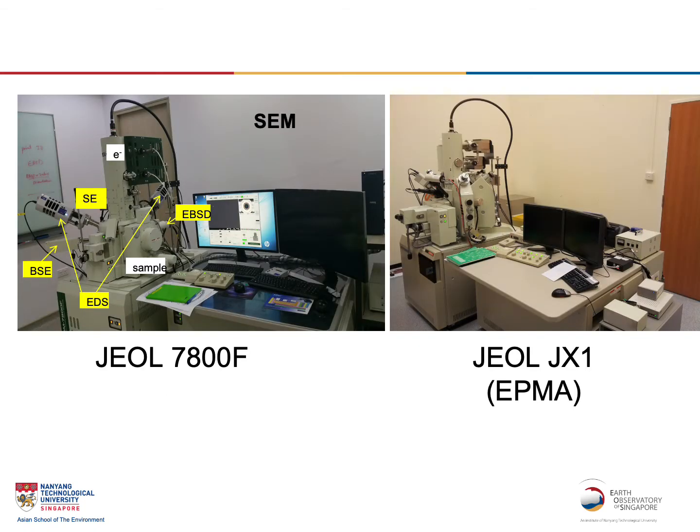Now back to this image, corresponding to the schematic earlier. The electron source is up here and then is pulled down and accelerated by the electric field, goes down and is bent, spread and converged by the magnetic lens somewhere in the column here, and we have the aperture down here to filter out some of the unwanted electrons.